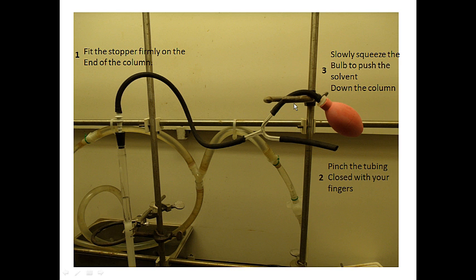So here's the device. You're going to take the stopper and put it snugly in the end of the column. Then that tubing goes to what's called a three-way glass Y, because it looks like a Y. And then we're going to attach one of these rubber bulbs to one end, and the other end is open. So to push the solvent through the column, number one, we fit the stopper firmly on the end of the column. And then occasionally we have to take it off and put some more solvent in and then put it back on again.